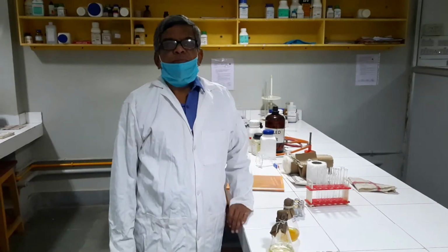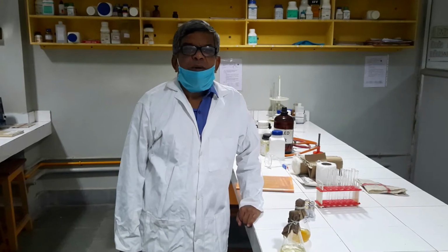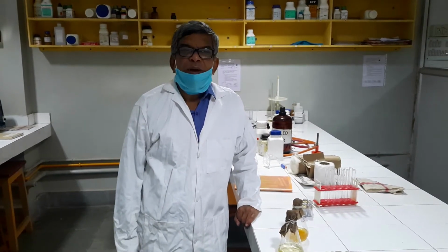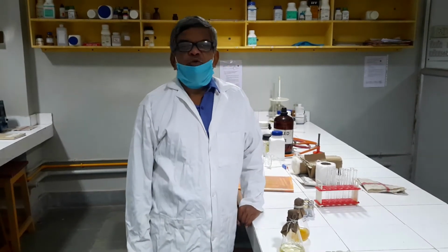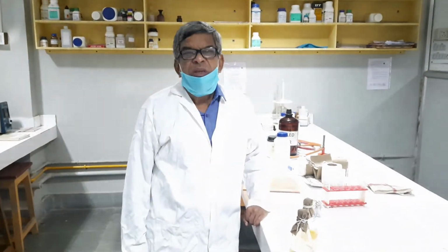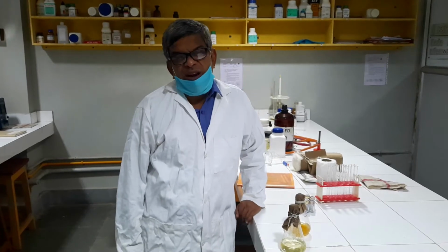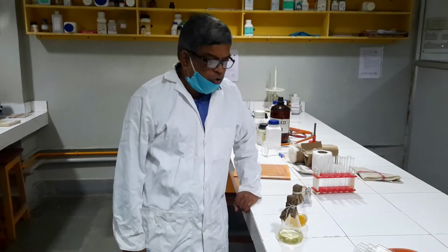Students, myself Roy sir, Gourango sir. I am discussing post sterilization handling of the media. We have seen at 15 pounds per square inch pressure, at 121 degrees centigrade for half an hour we have autoclaved the media.